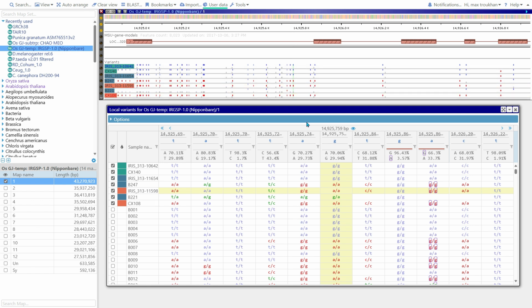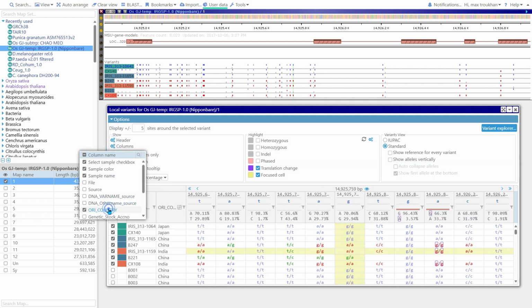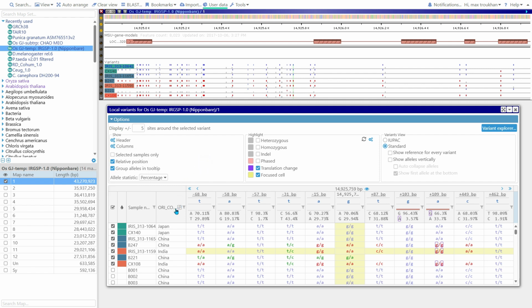The interface that opens will display genotypes in a grid format. The selected samples appear at the top of the table, though the grid includes all samples available for this genome. Each column header provides allele statistics. We can add a column with sample qualifiers and group the rows by its values, which can help identify irregularities in allelic distribution across different groups.